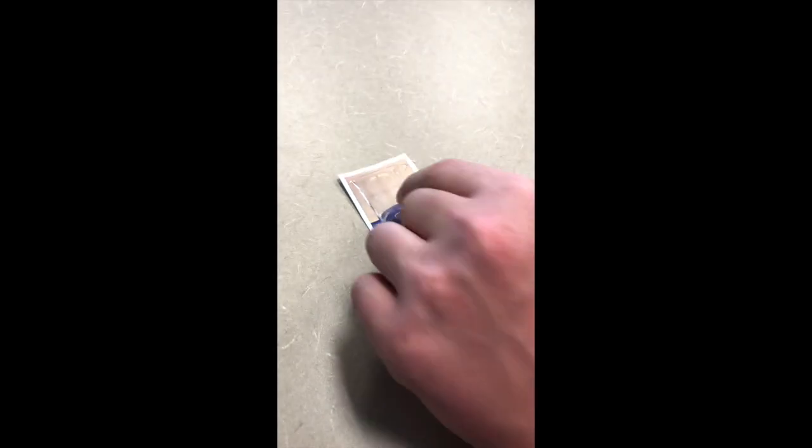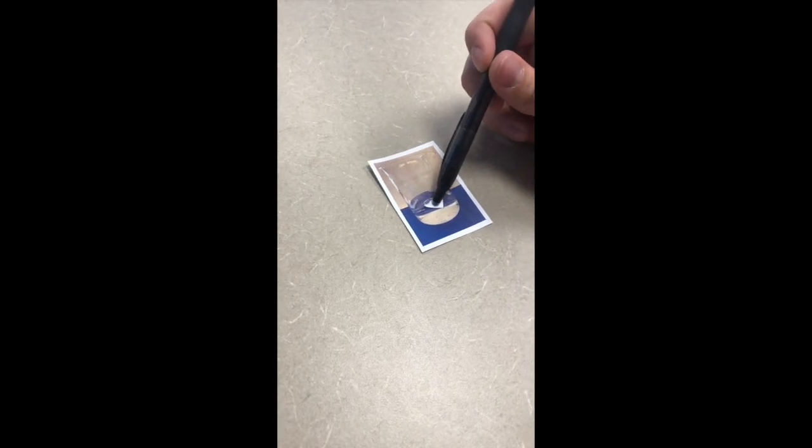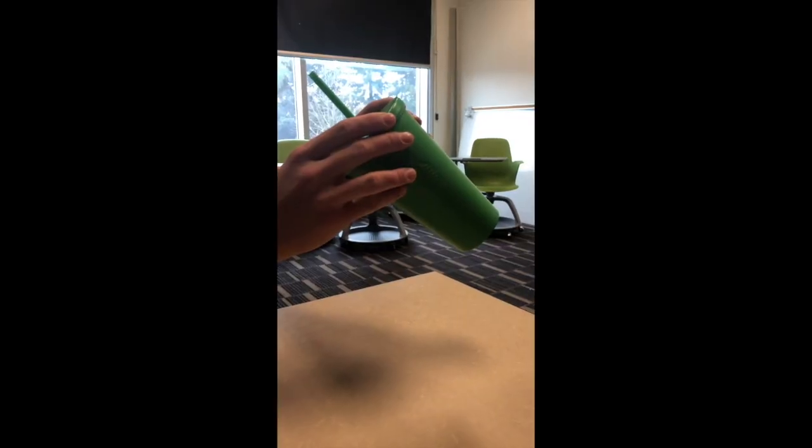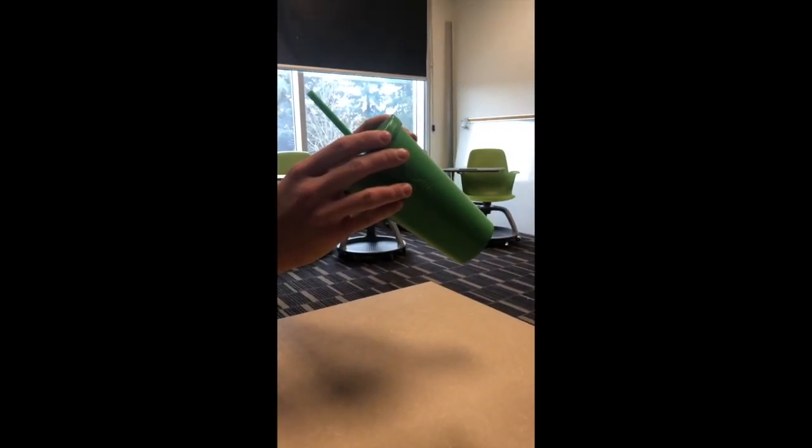So we put a cotton ball, and then we're going to draw up the liquid by putting the Pasteur pipette in the middle of the cotton ball. And we're going to draw up that liquid and put it in another container. To actually remove our solvent, we will use a rotary evaporator.